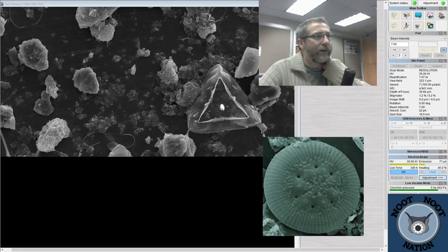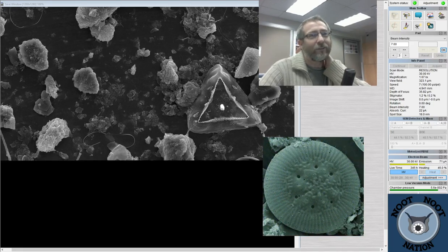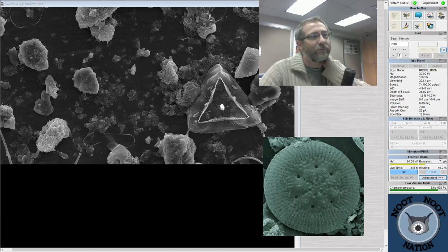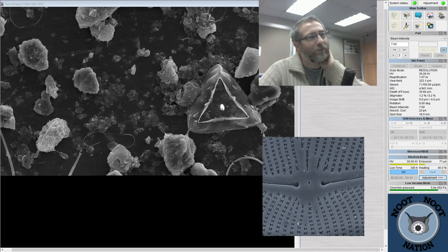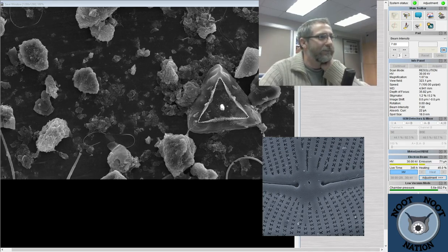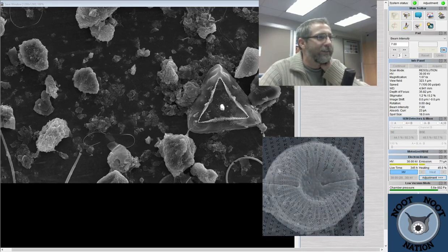So, can we go to atomic depth? White Knife asks, and the answer is not really. We can get down to nanometers, and usually pictures get kind of blurry after that point. I mean, I can keep turning the knob to zoom us in, but you won't be able to see it very clearly. So, there is a scale.